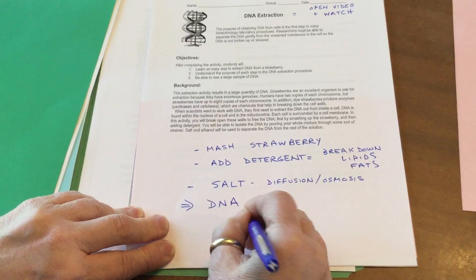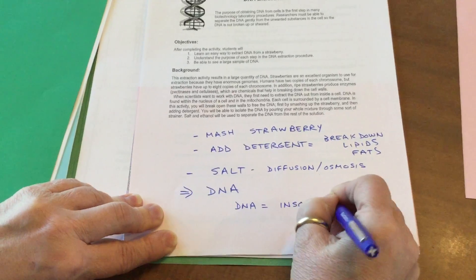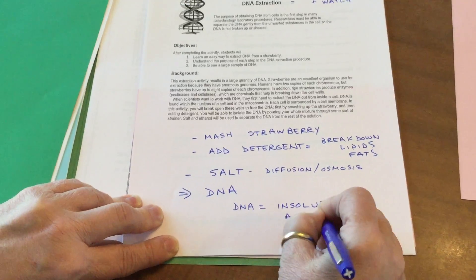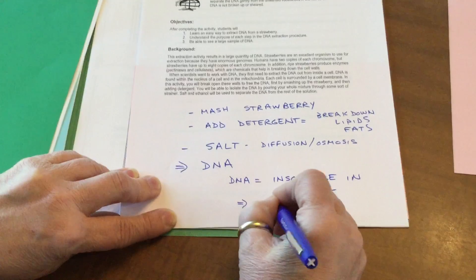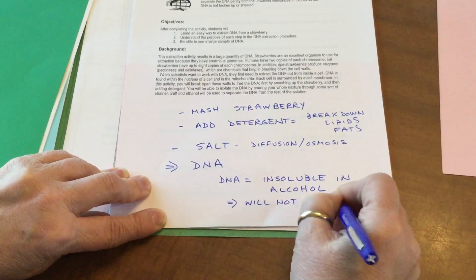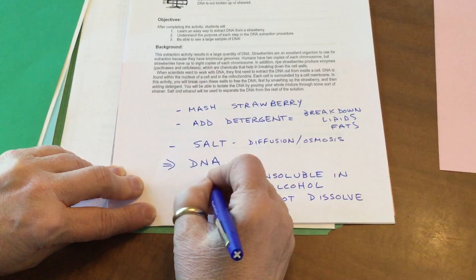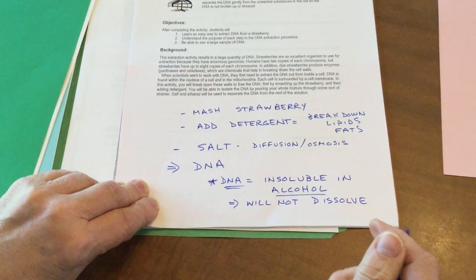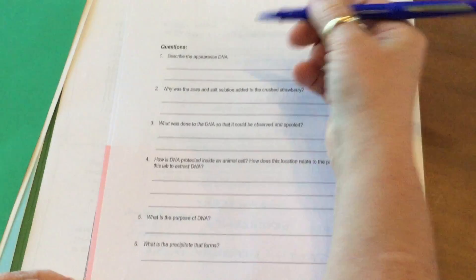Some other things you need to know: DNA is what we call insoluble in alcohol, which means it will not dissolve. So our purpose is to see the DNA because it's not going to dissolve in alcohol. Once you watch the video, you'll be able to see that, I hope.